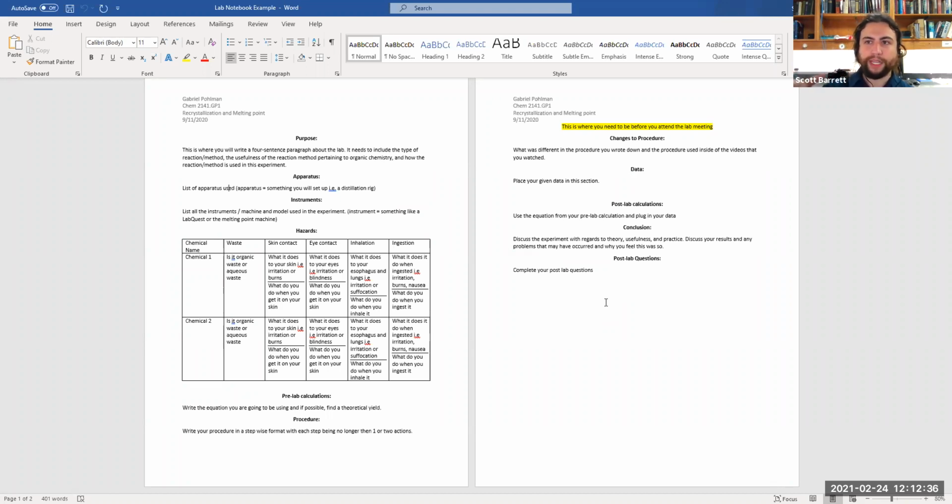If you had a full beaker of a solution that was recrystallizing and you placed it into an ice water bath, it could shatter, possibly harming you, but also spilling all the solution out into the ice bath. And then you just have a full ice bath full of your solution. It happens in labs, and we want to learn that so that we can avoid it in case it were to occur in a lab where you were performing research or something like that.